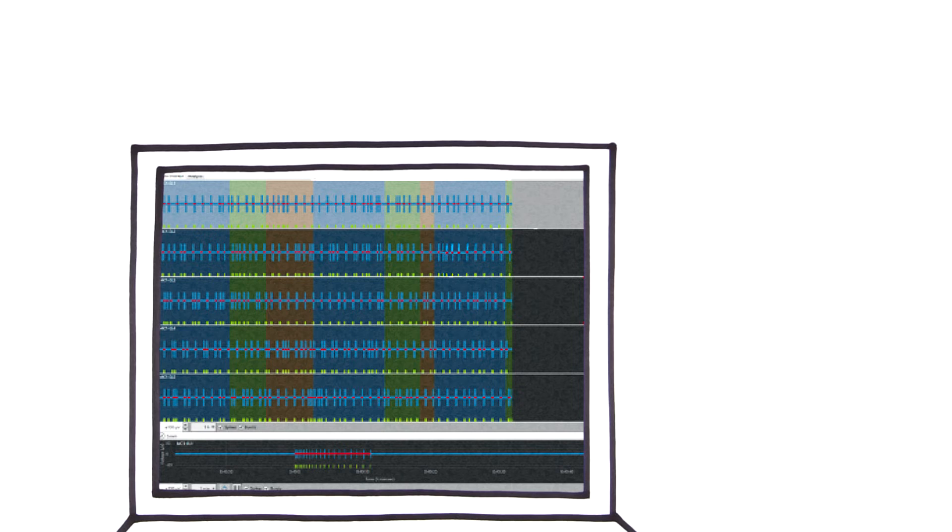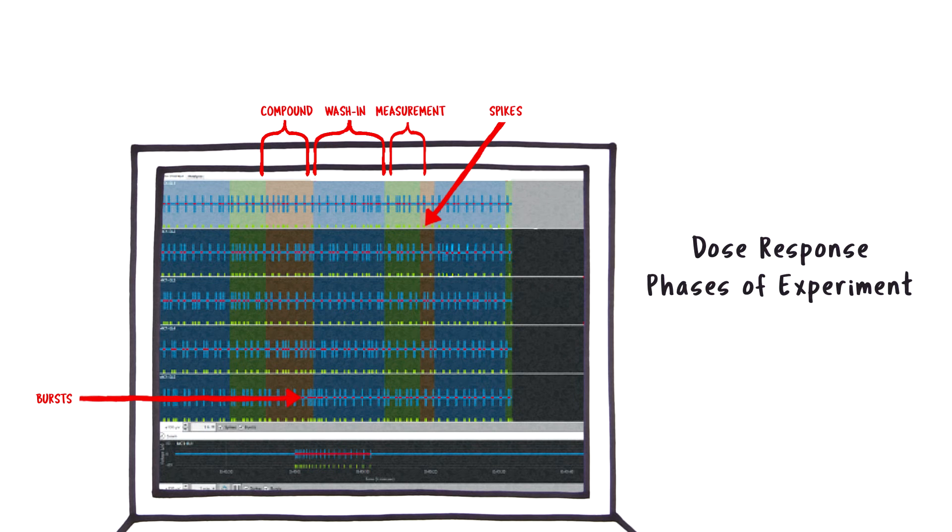After I hit record, BetaScreen starts to look for spikes and bursts for specific analysis that indicate dose response as well as the various phases of the experiment.